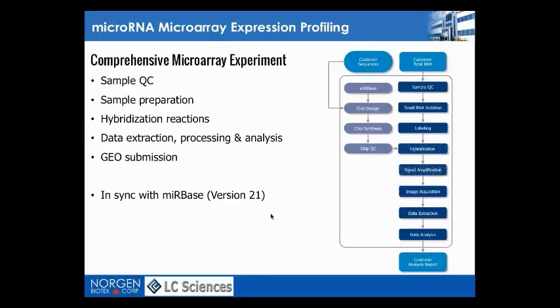As mentioned, I want to focus on microarrays and RNA-seq solutions here, and compare them, what to pick, and the advantages and disadvantages. So if we look at the microarrays, it's of course a robust method. It had initially a bad rap due to the early years in the gene expression field, but once it hit the microRNA community, it was already proven and reliable. So it's a very reliable, high throughput method.